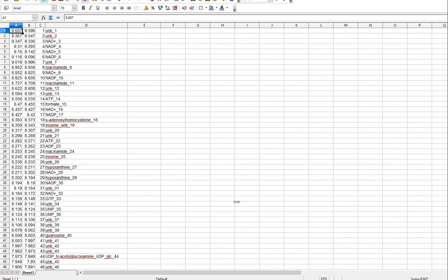This data may be reformatted into a tab-separated file known as a pattern file by the Bruker AMIX community. This file contains at least 3 columns, with the first 2 columns representing the left and the right boundaries in ppm of your peak, and the third column an annotation for that peak. Here you can see we have left and right boundaries for a series of peaks, and then an arbitrary number for each in the third column. More complicated, more informative annotation is also provided in an optional fourth column.